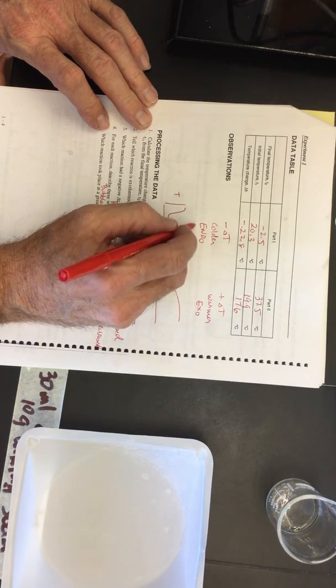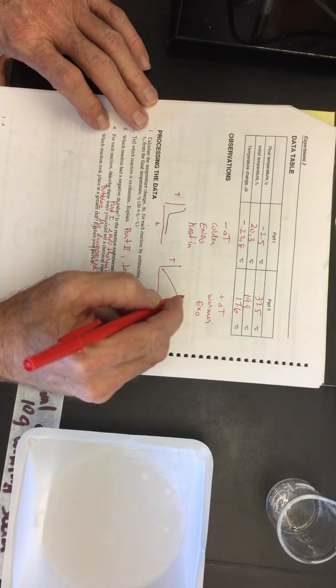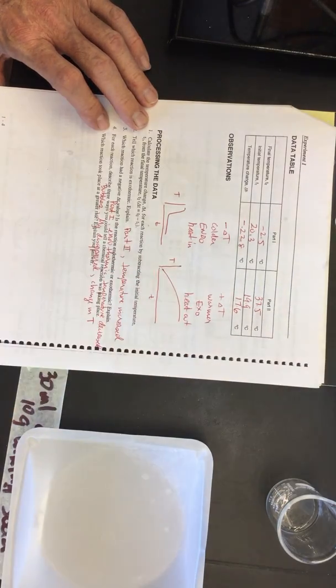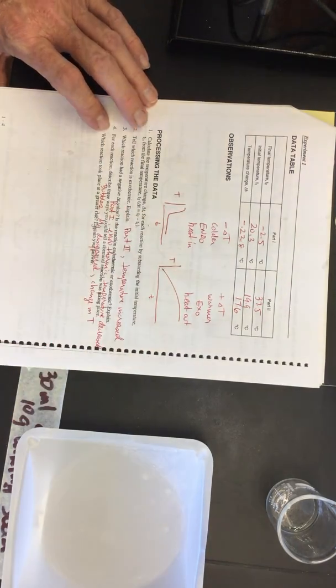Okay, with an endothermic reaction, heat is pulled in, making the surrounding environment cooler. Exothermic reaction, heat comes out. The temperature increased, the heat's coming out. Heat goes in, the temperature is decreasing in the endothermic reaction.